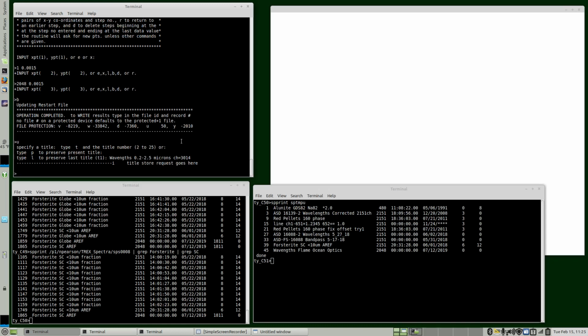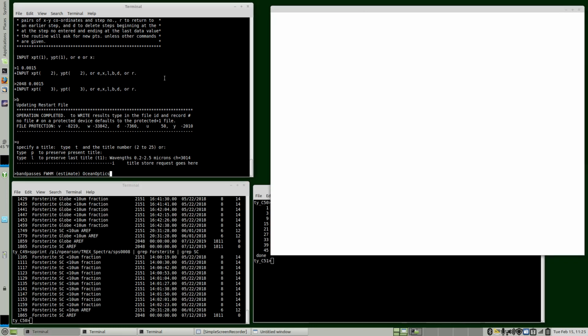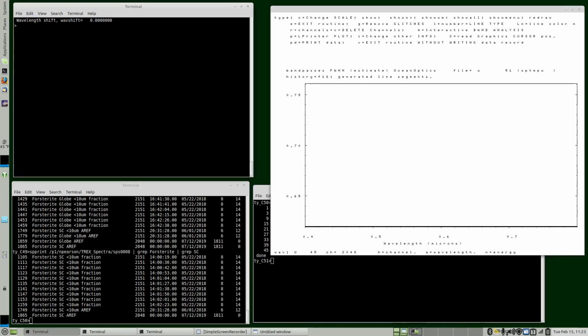And this should be, and that's probably good enough. And we see the numbers are very low.